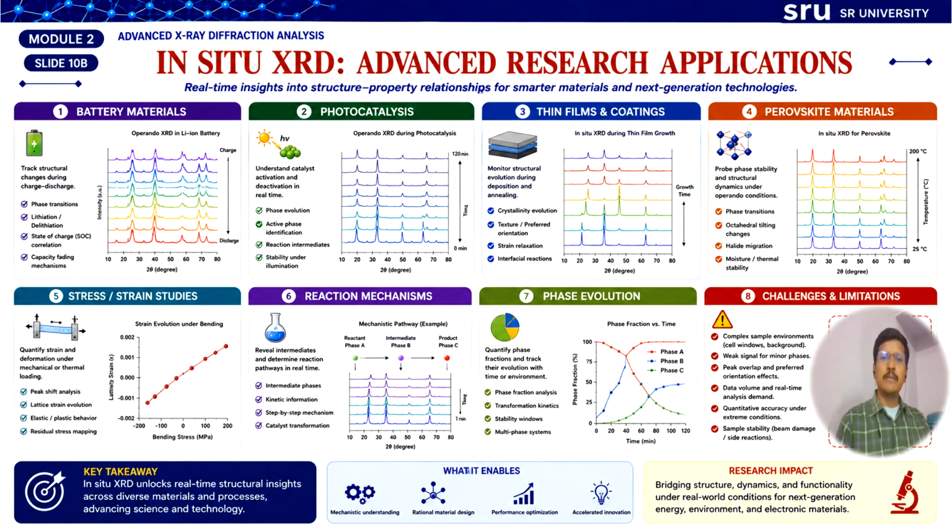In situ XRD measurement provides these structural changes directly by tracking diffraction peak positions and widths. This helps the researchers to evaluate elastic deformation, plastic deformation, residual stress, and fracture mechanisms.